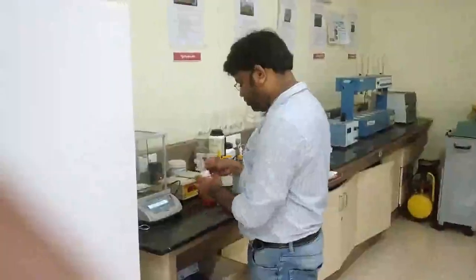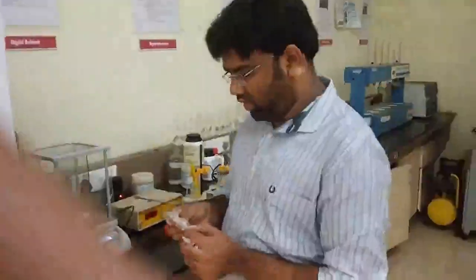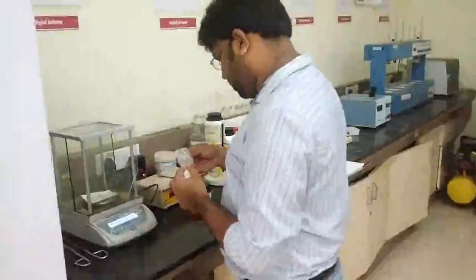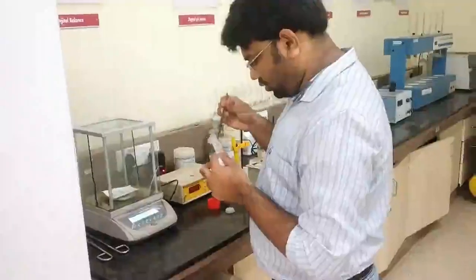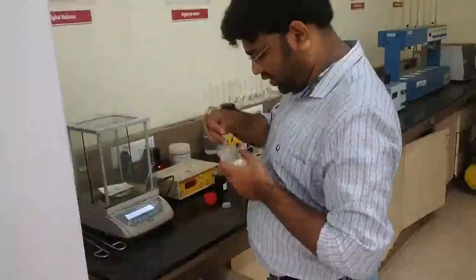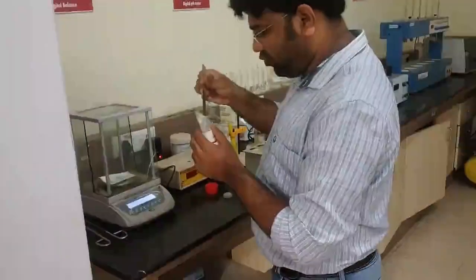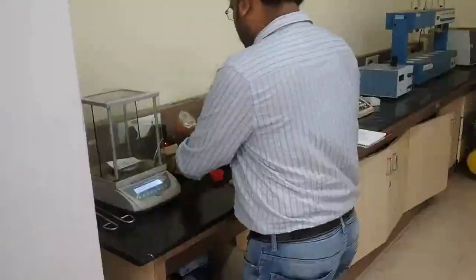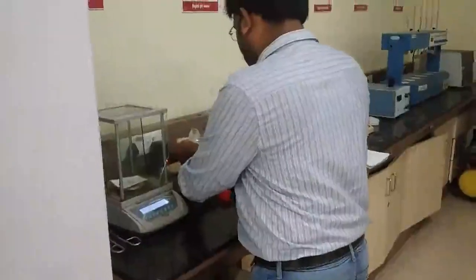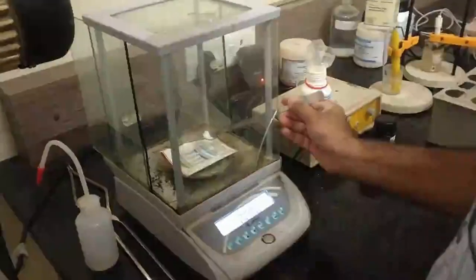So we are going to start with the experimentation procedure of COD experimentation. The very first step is that we need to take 400 milligram of the mercuric sulfate, that is HgSO4. So we have this mercuric sulfate with us. 0.4 gram. So we are going to measure it on the scale, right? So 0.4 gram of mercuric sulfate.